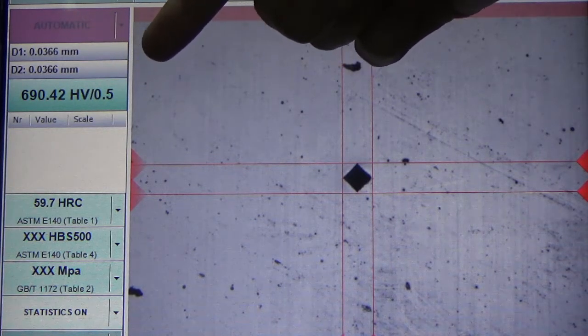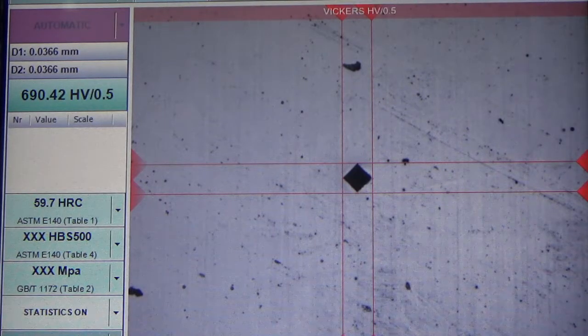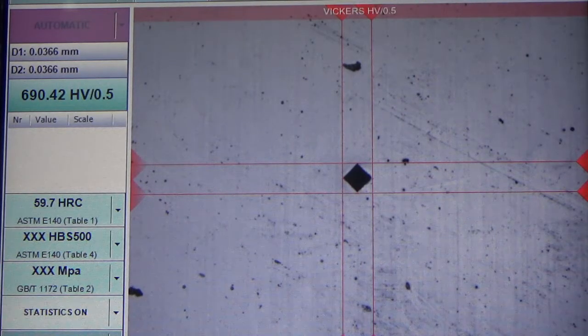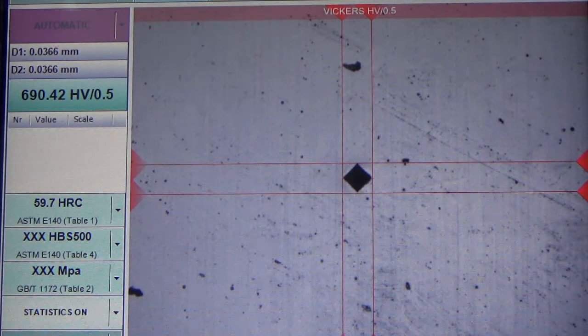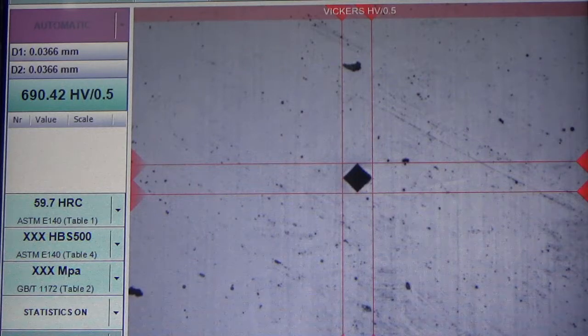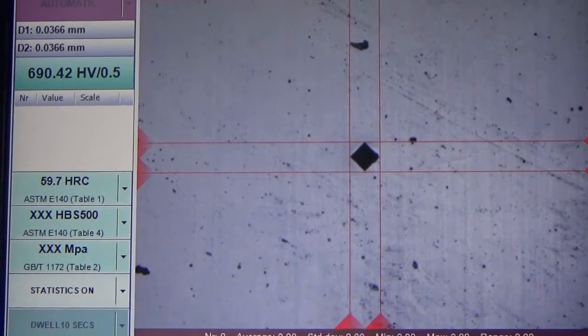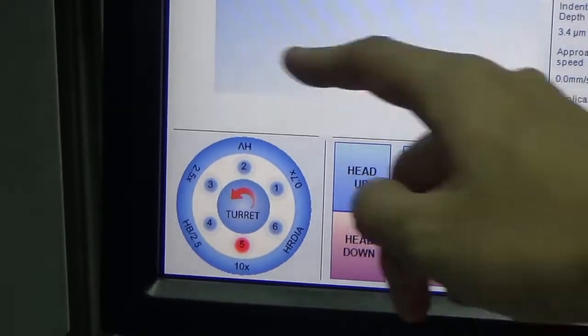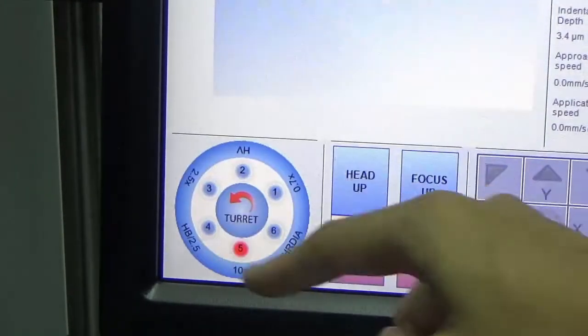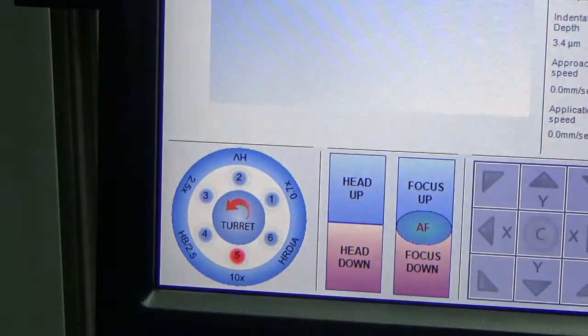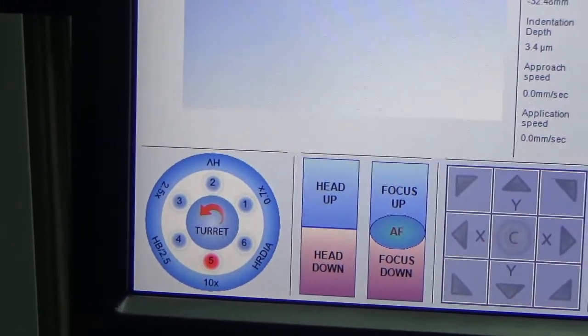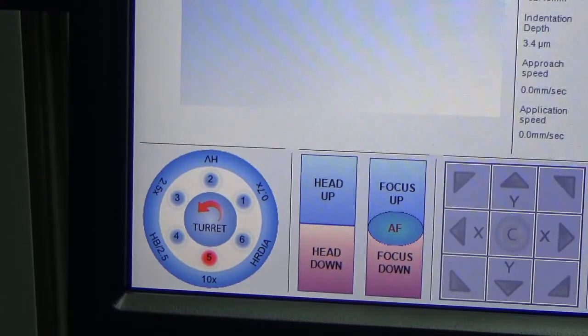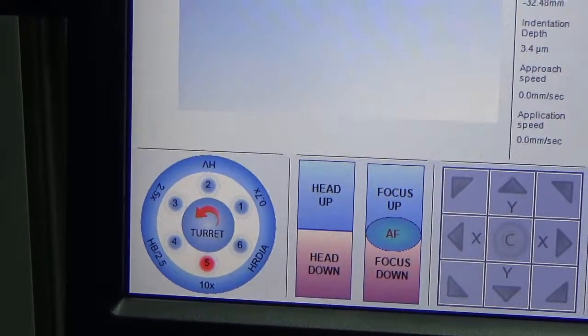If you wish to do other scales such as Rockwell and Brinell, you will just need to change the turret configurations at the bottom part, and you will be able to carry out Vickers, Rockwell, and Brinell depending on your application. That's it for the Nemesis 9000 universal hardness tester from InnovaTest.